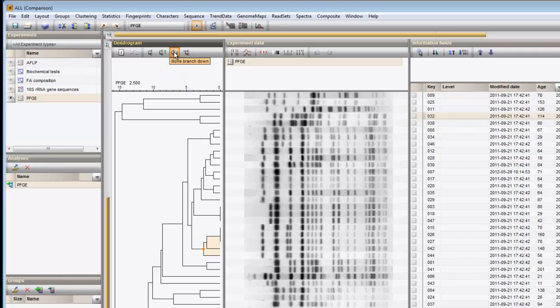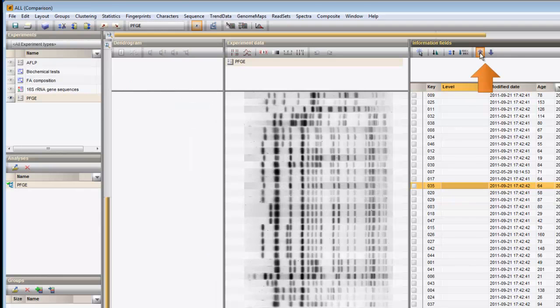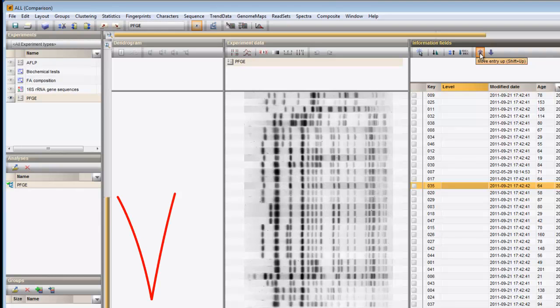Note that you can also move individual entries up or down in a comparison. If I want to move an entry up, I highlight it and press the move entry up button in the panel of the information fields. Of course, since the order of entries that I enforced conflicts with the order of the tree, the tree is automatically removed.